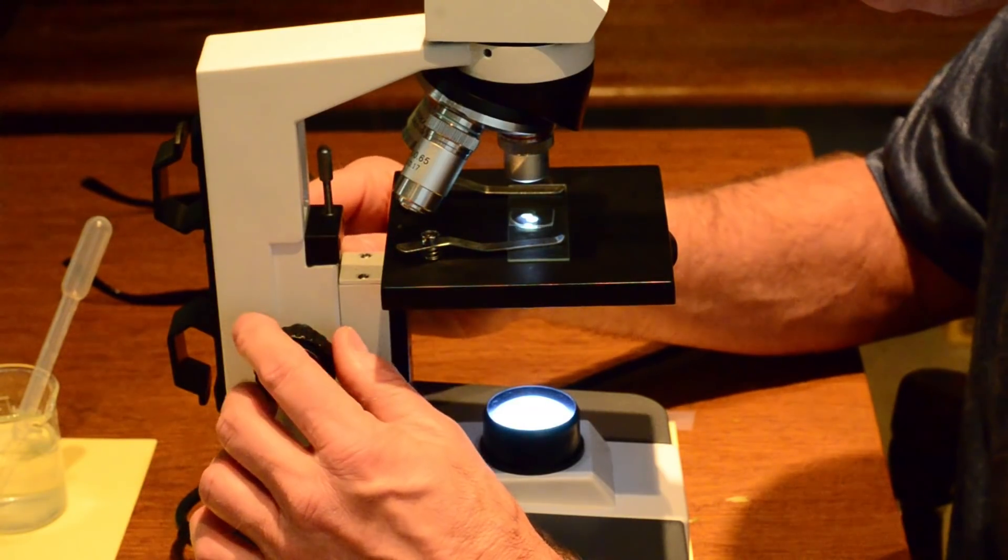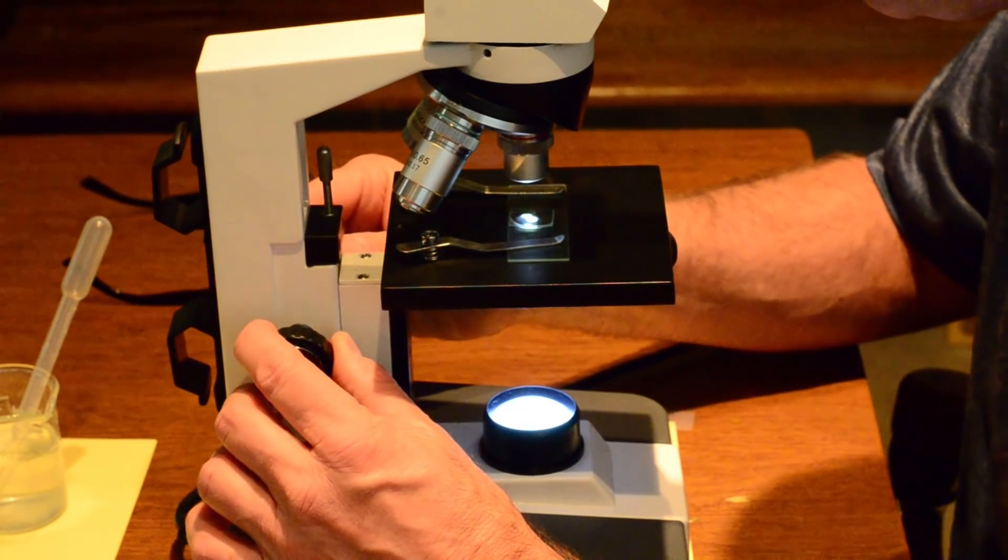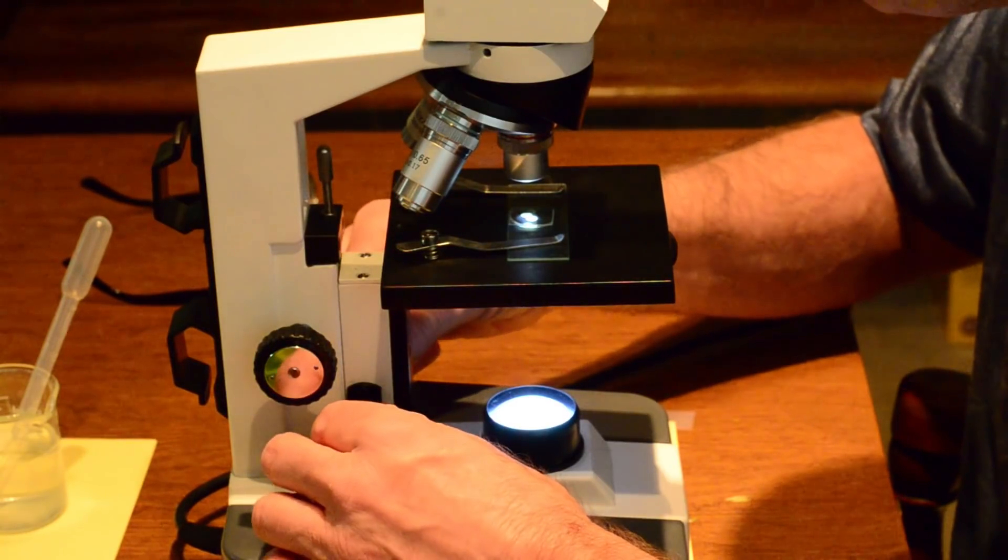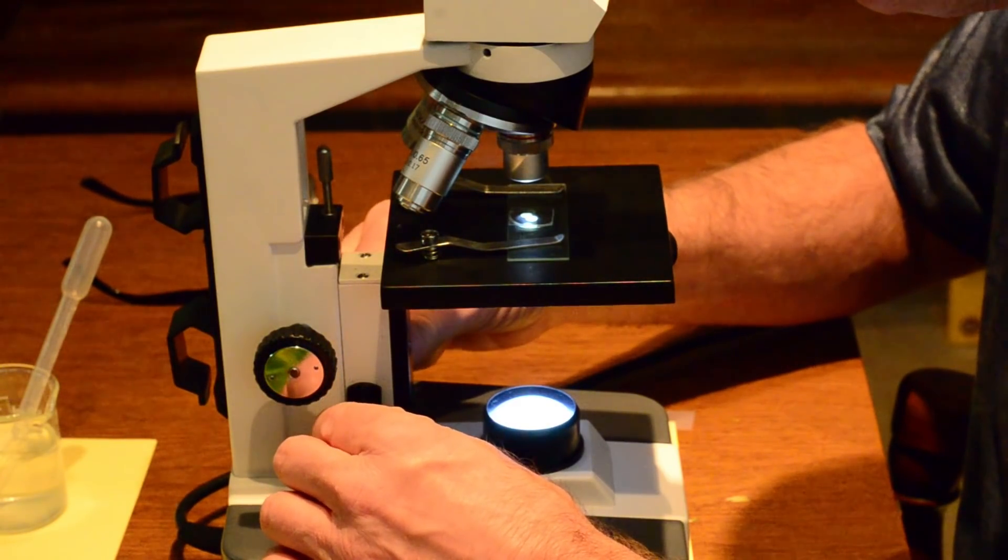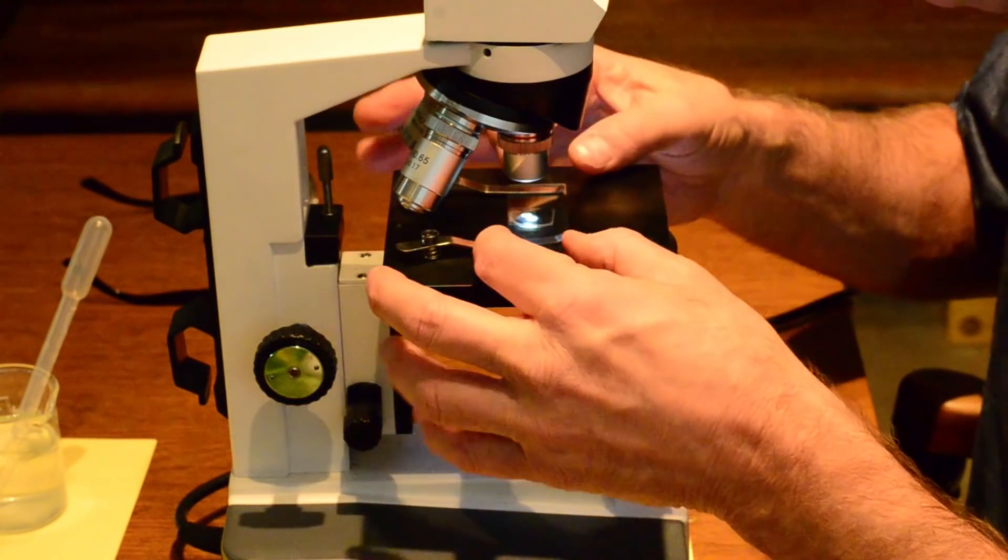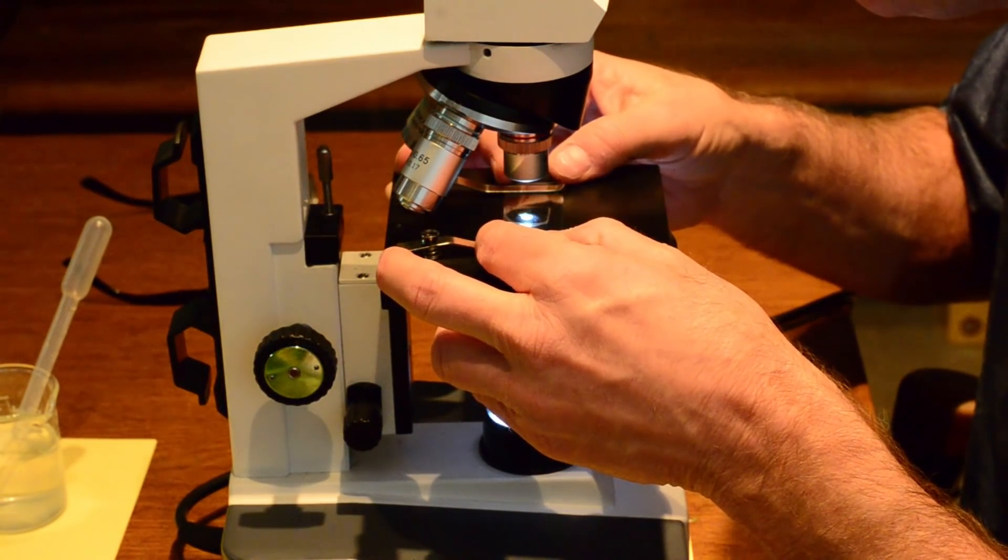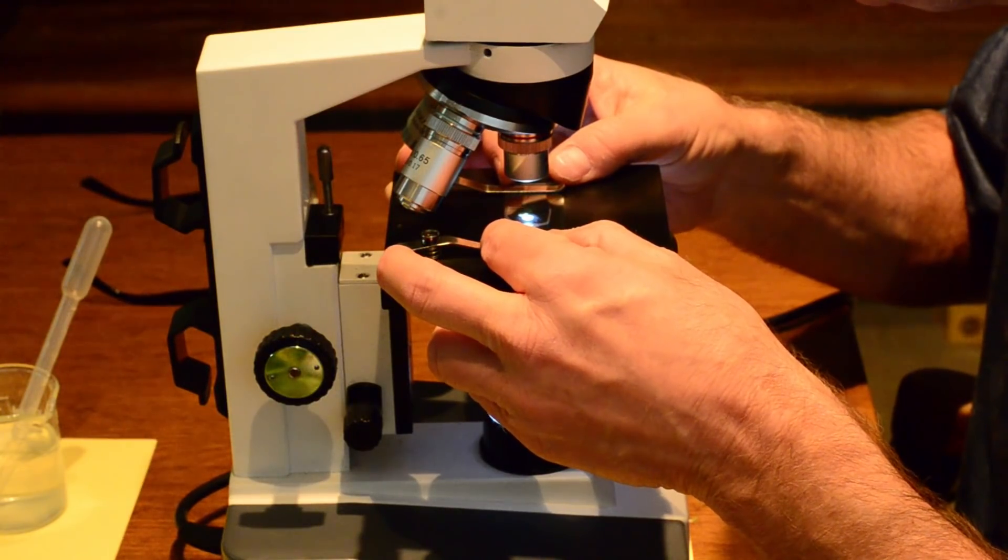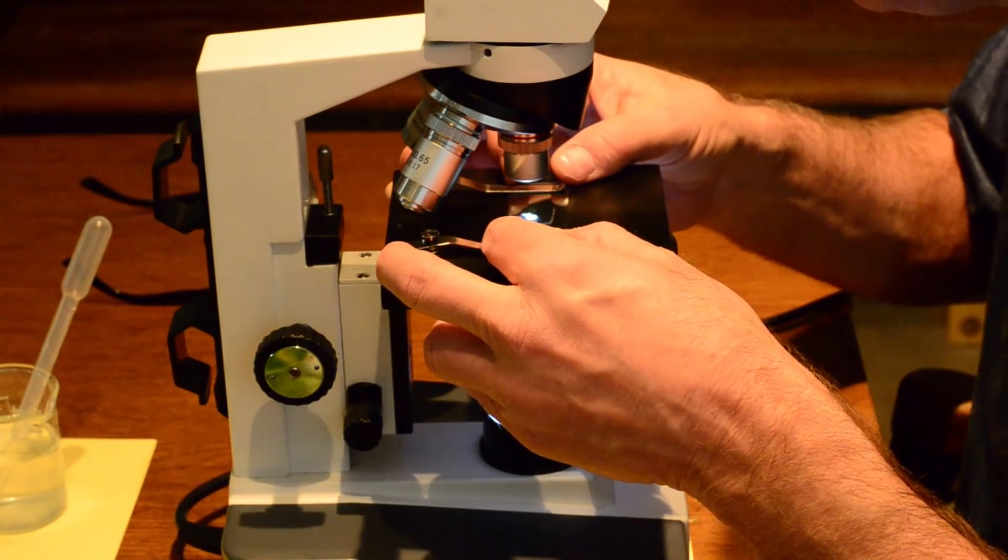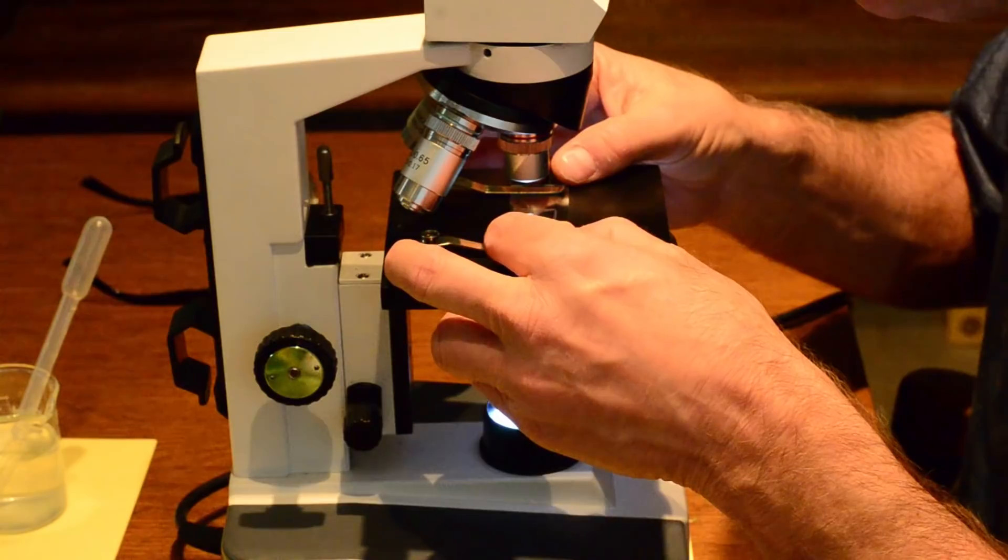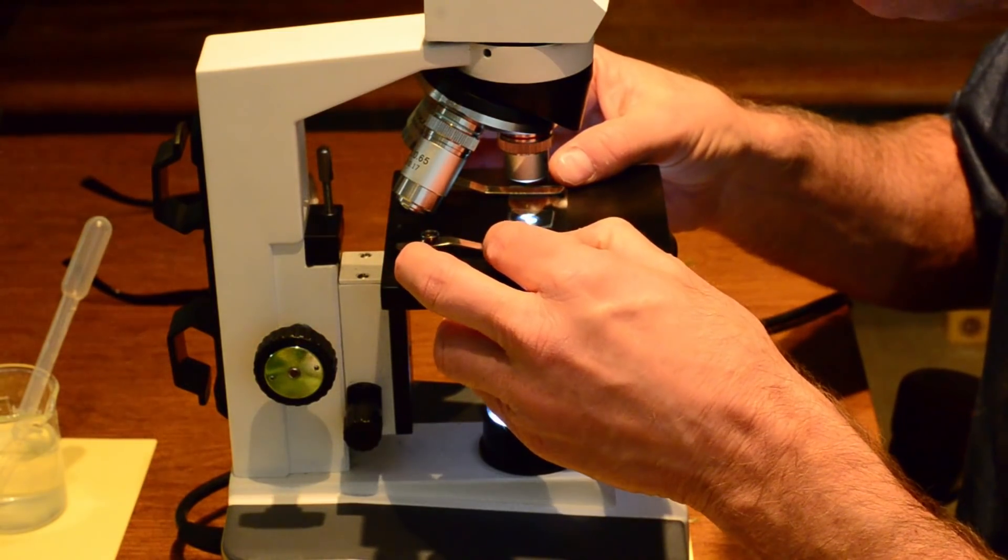And I can see that the tubes, the xylem and the phloem and some cortex cells. I want to fine adjustment, just a little bit. Wow. And I'll move it slightly to see the pith. Yeah, that is really neat, you guys. I still get excited at looking at plant tissues even though I've seen it over and over and over again.